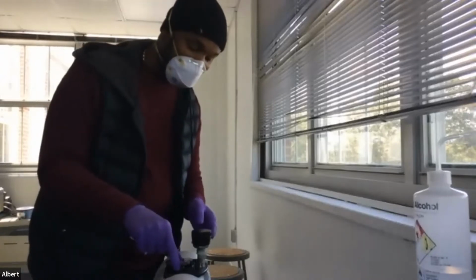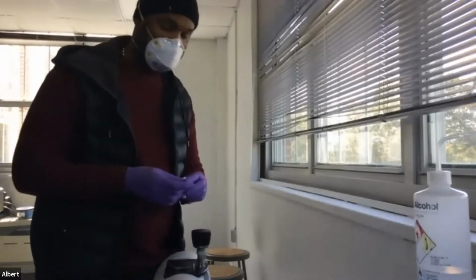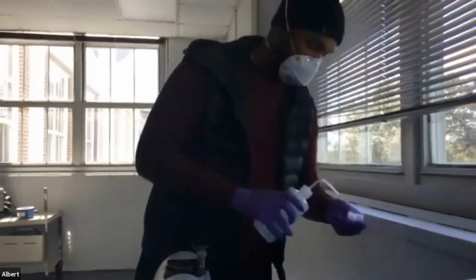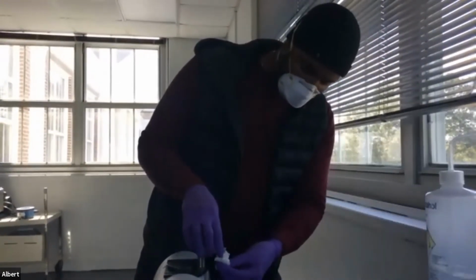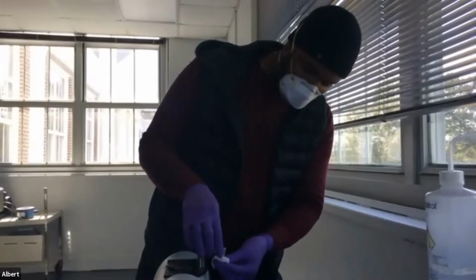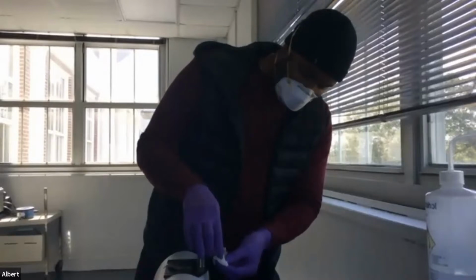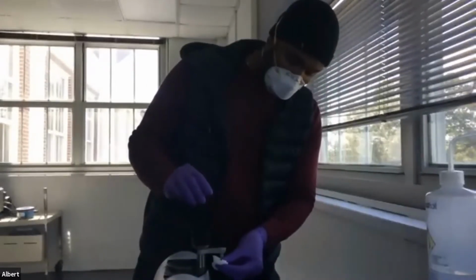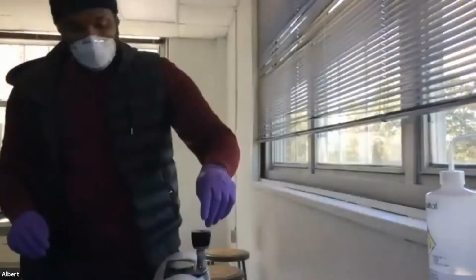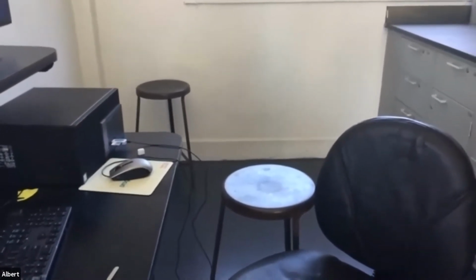I also need to clean the arm because it was touching the sample as well. So I just put a little ethanol on my Kimwipe, and I'm going to clean that off as best I can and make sure there's no leftover crude aspirin on that. All right. Now let me show you this again because I didn't have the actual plate on there that was supposed to be on there. Let me make sure it's on properly.